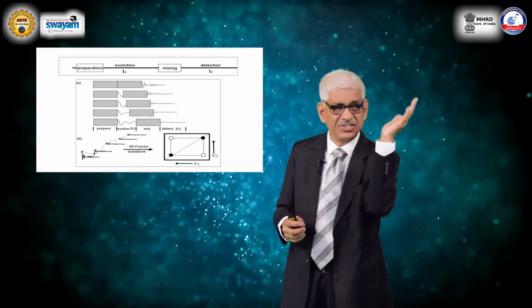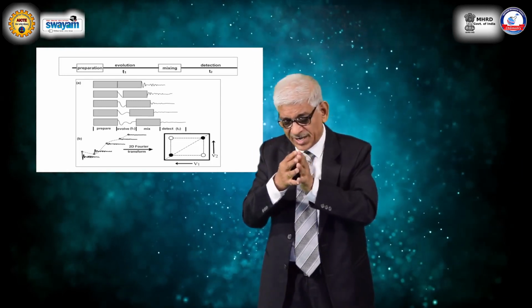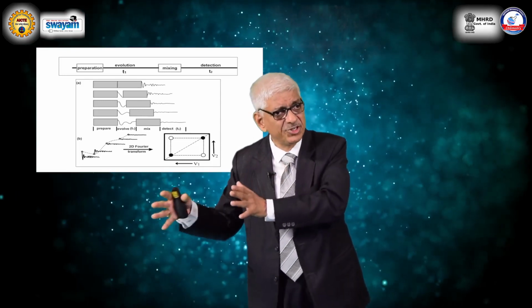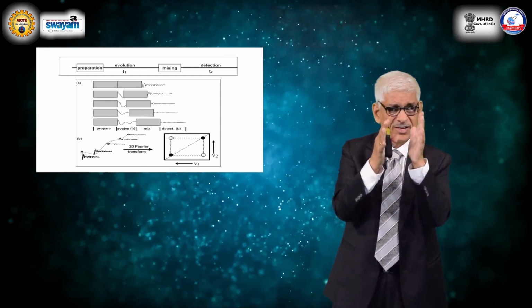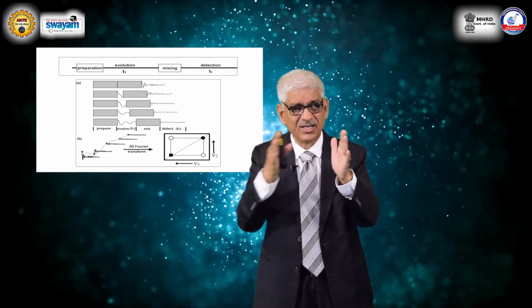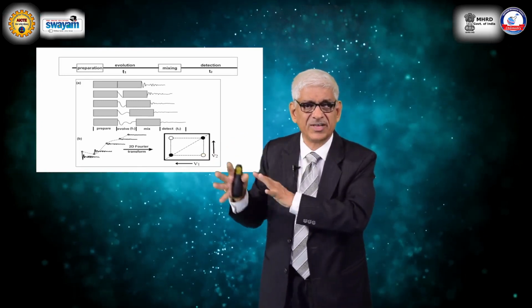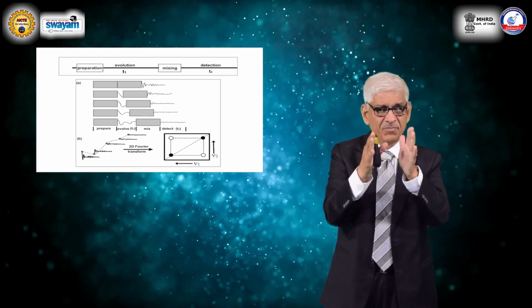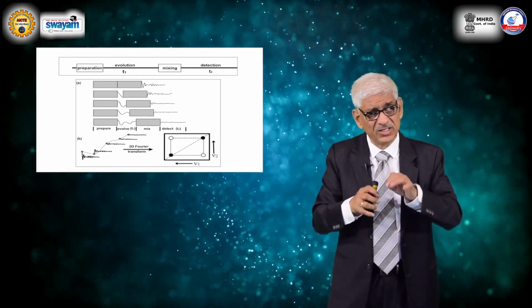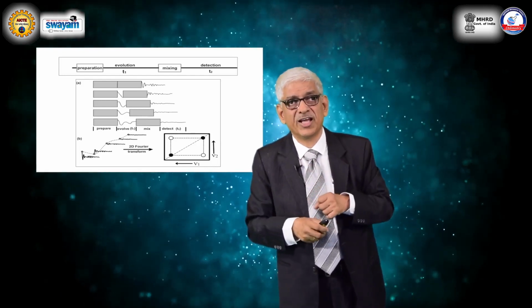Remember that the FID which I collect as a function of time after the pulse is removed, at every point in the FID I have full frequency information. The frequency information is not lost. Therefore, if I create a small gap between the excitation and my detection of the signal, I am not going to lose anything with respect to the frequencies, but it gives me a time window where I can do various kinds of manipulations. And this was exploited very elegantly to develop what is called two-dimensional NMR.